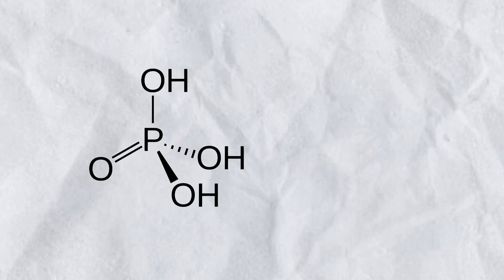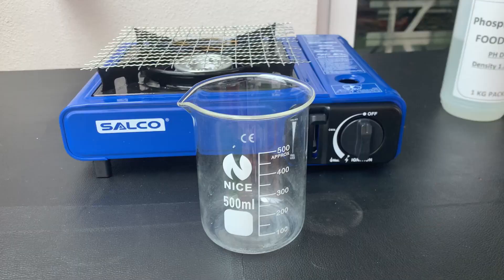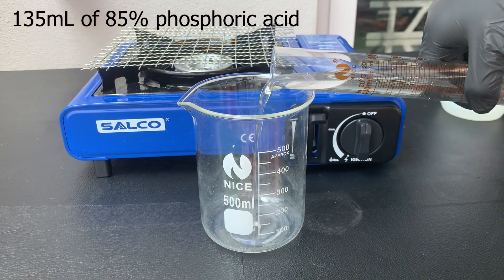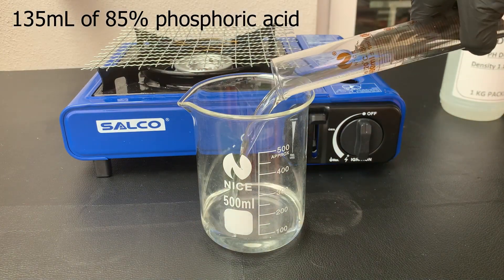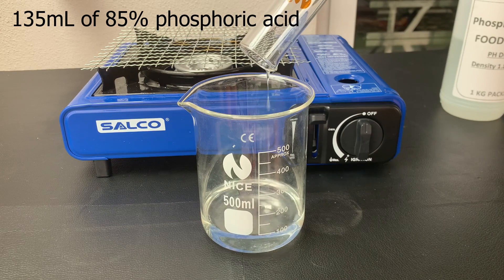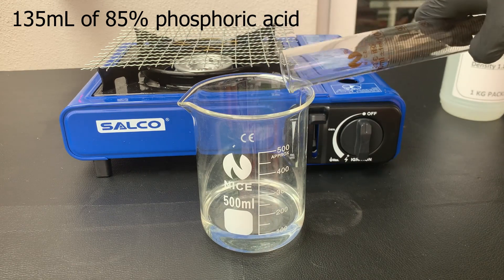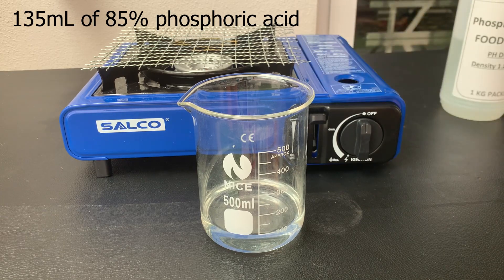To make the oleum, we're going to have to firstly dehydrate phosphoric acid and turn it into metaphosphoric acid. To dehydrate the phosphoric acid, I firstly measured out 125 mL of phosphoric acid and added it to a 500 mL beaker. Since we are going to use high heat to dehydrate the phosphoric acid, try to use a beaker that is made out of borosilicate glass.